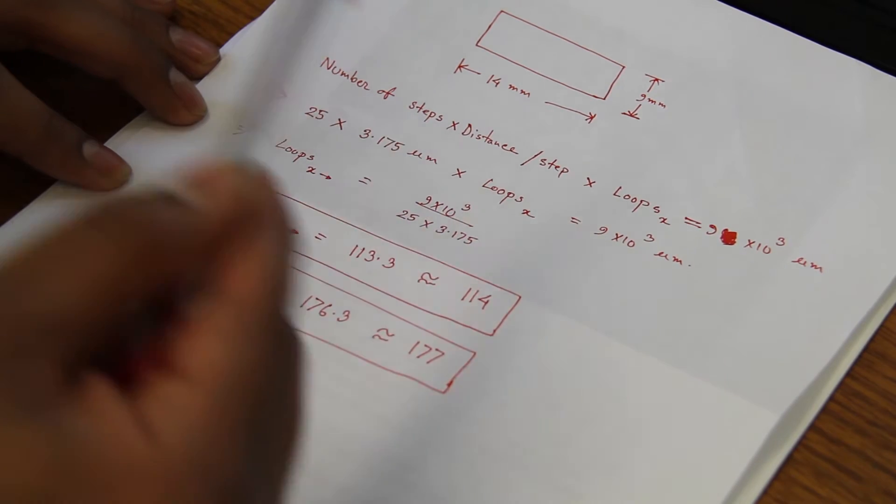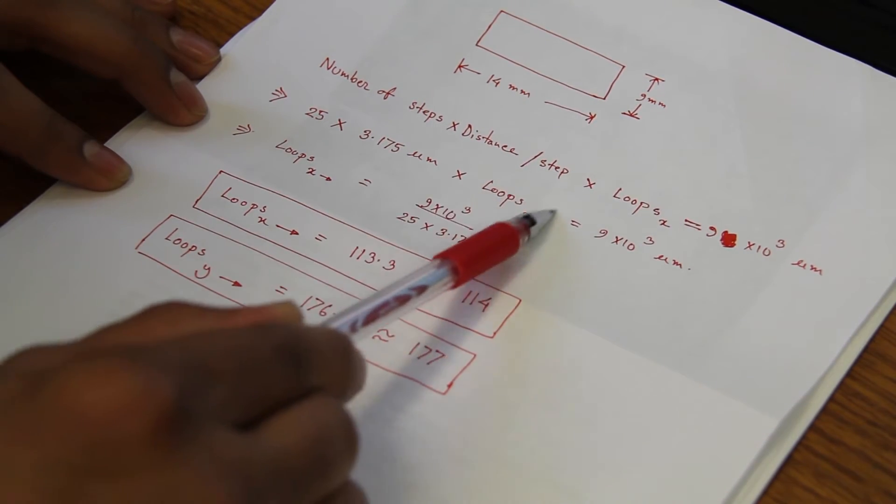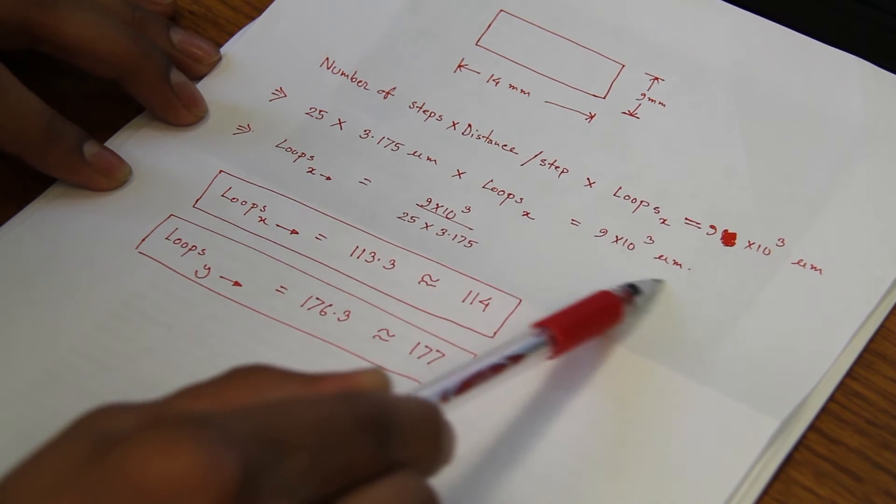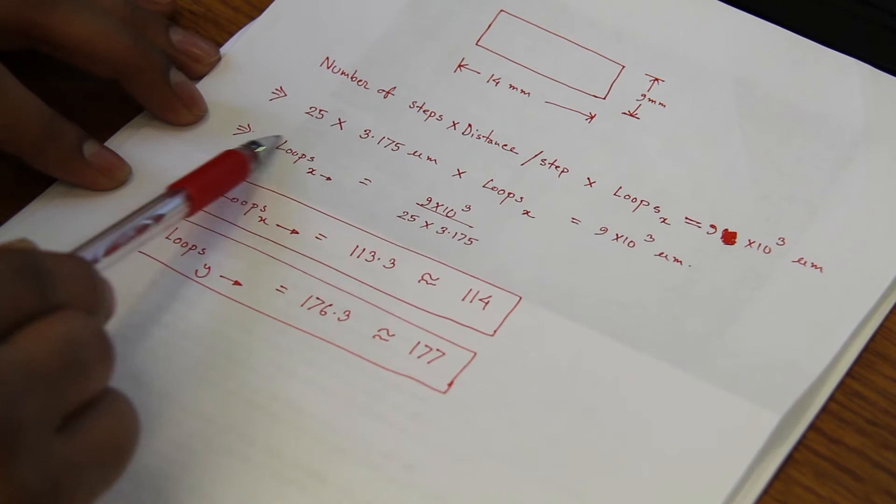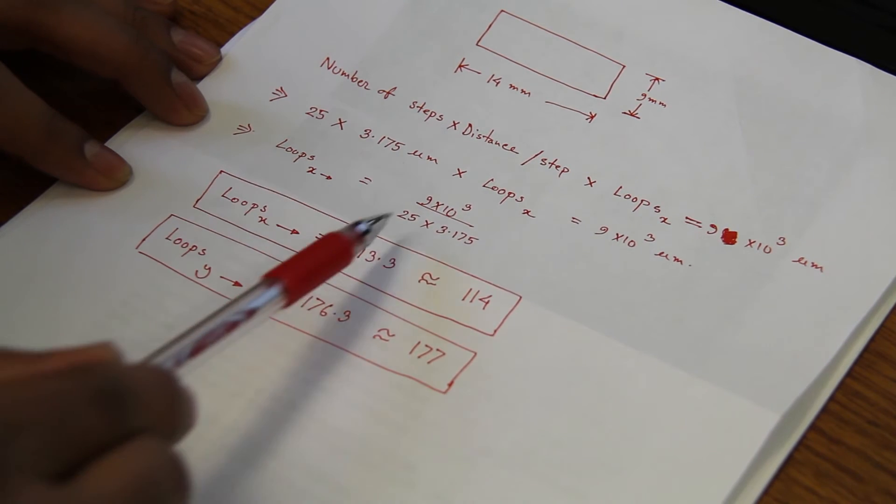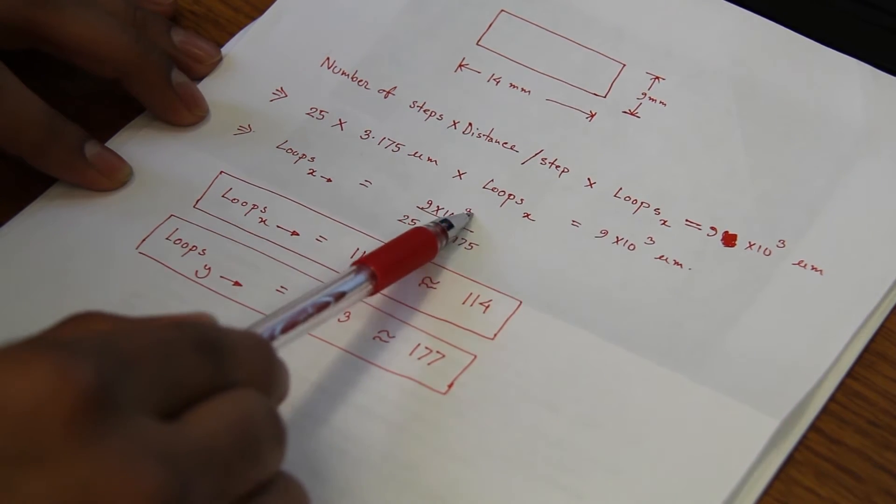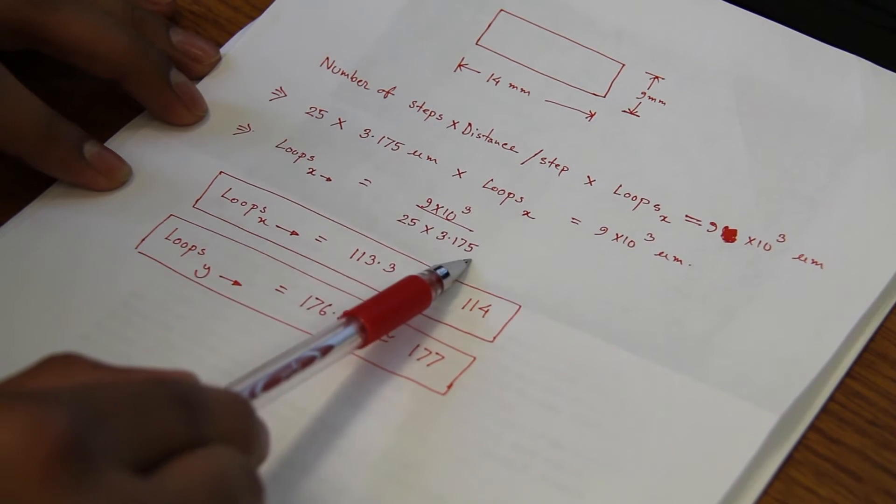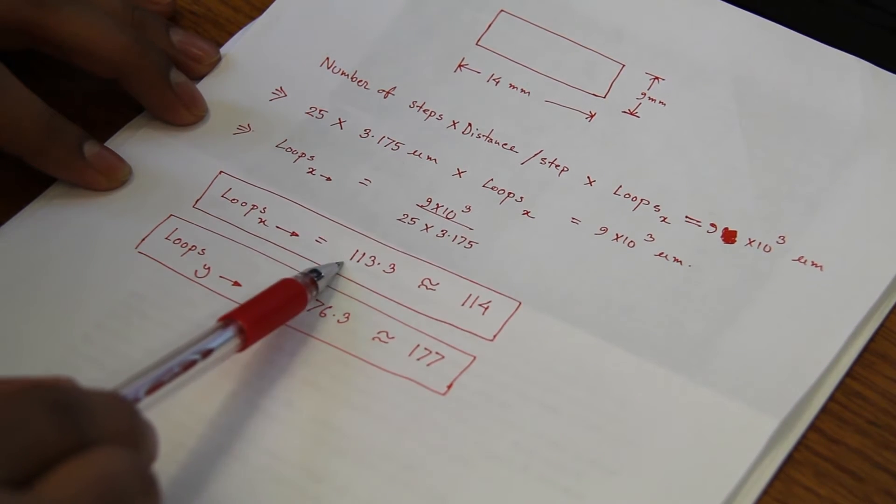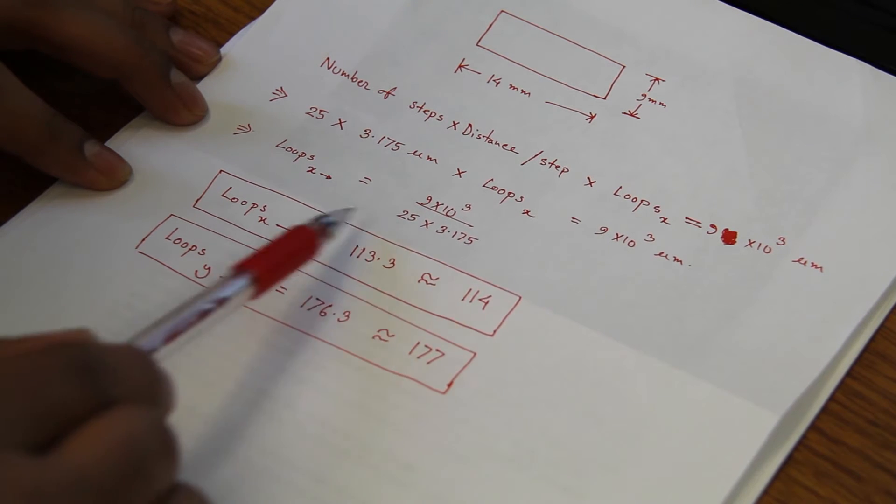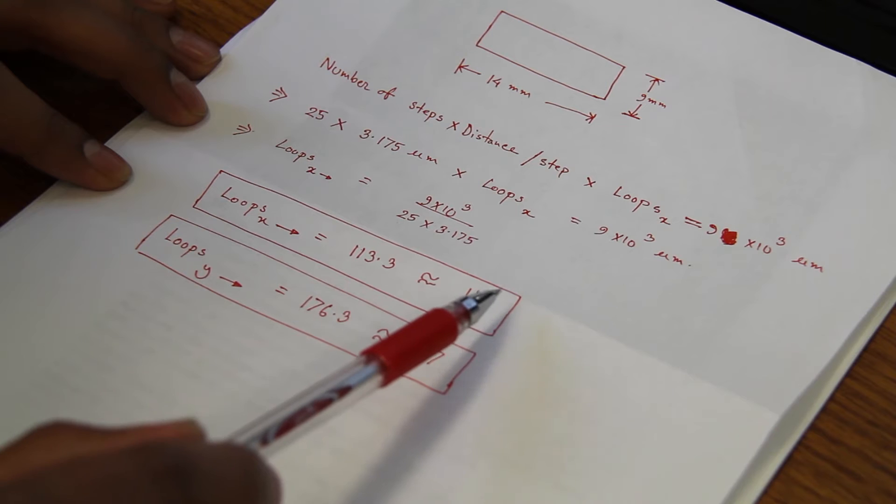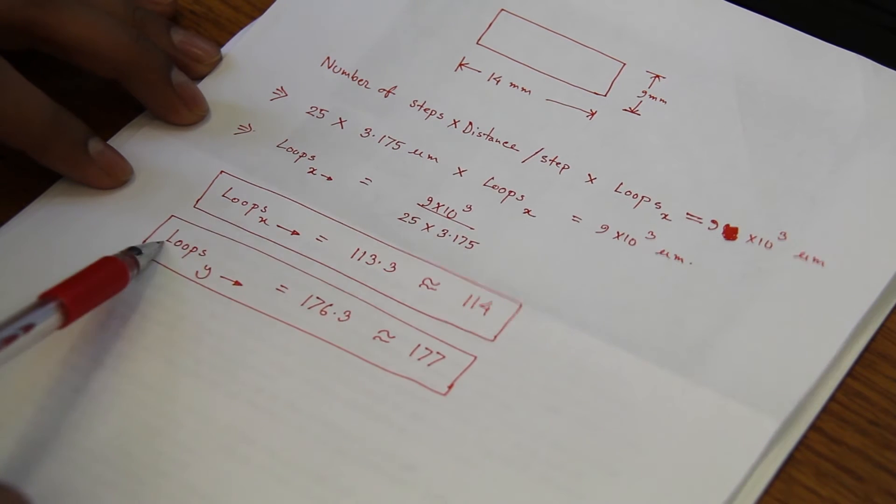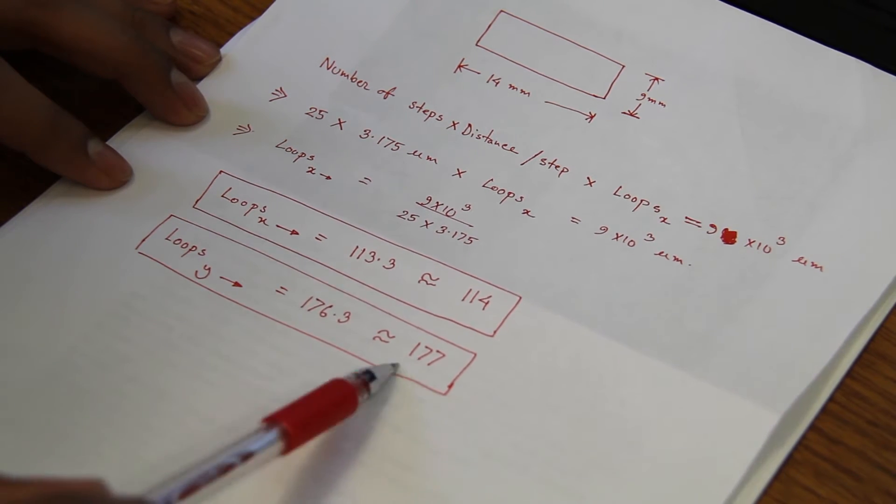Number of steps for this scan we need to do to cover 9 mm. So the number of loops in X axis will be 9 multiplied by 1000 divided by 25 multiplied by 3.175. It comes to 113.3 loops. So we will do 114 loops for the X axis and for Y axis we will do 177 loops.